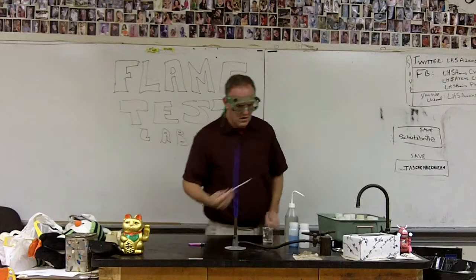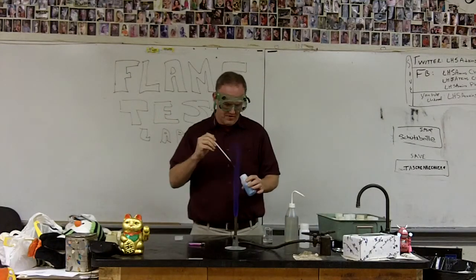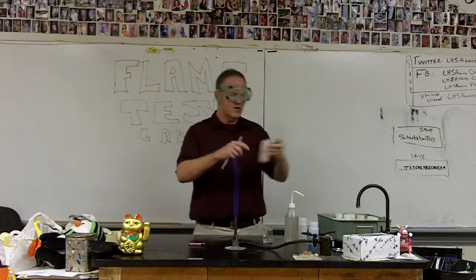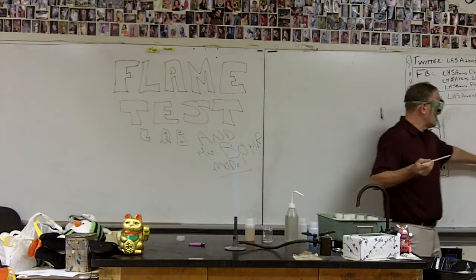So I'm going to take one of my salt solutions now that I've got it relatively clean, take off the lid, and dip the nichrome wire in. That's another reason I want to clean it off first — I don't want to contaminate the salt solution. I'm going to put it on the edge of the flame where it's the hottest and I'm going to see a color. I can see a light purple flame. Whatever salt that is, it obviously gives off that kind of light purplish flame.